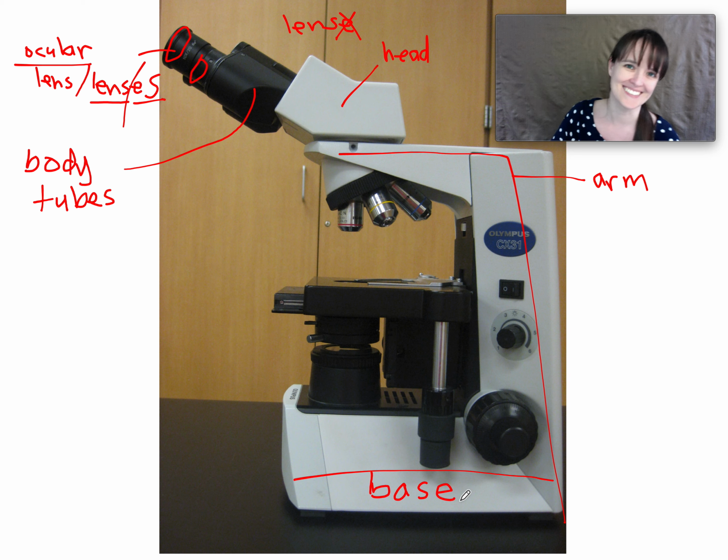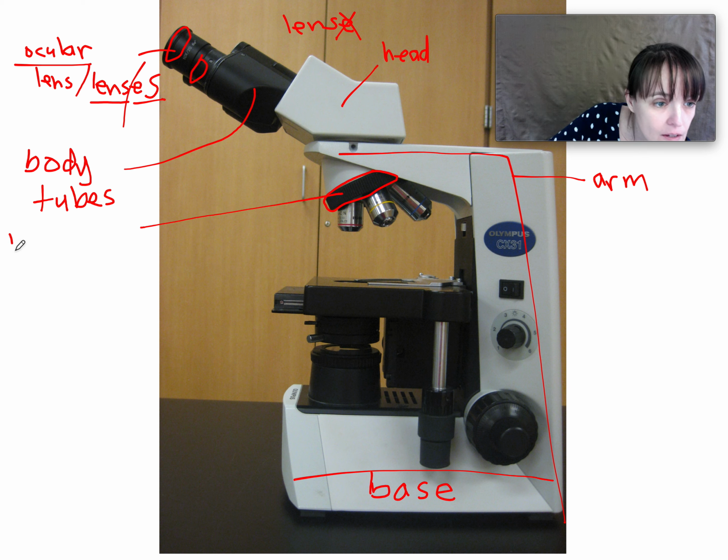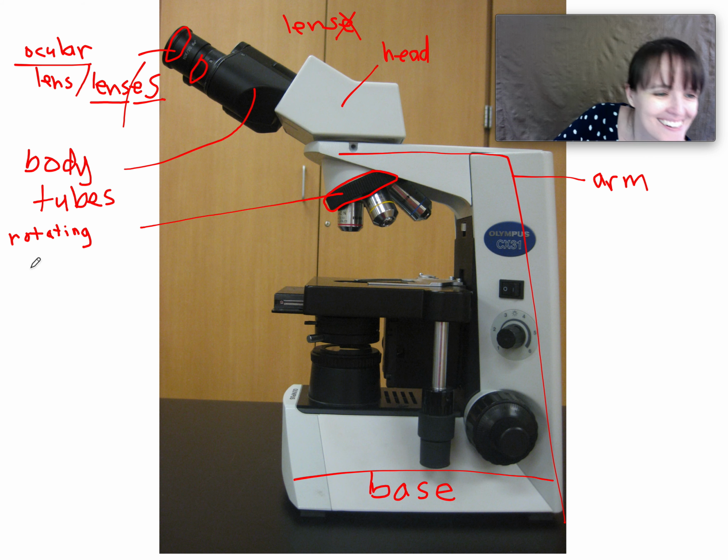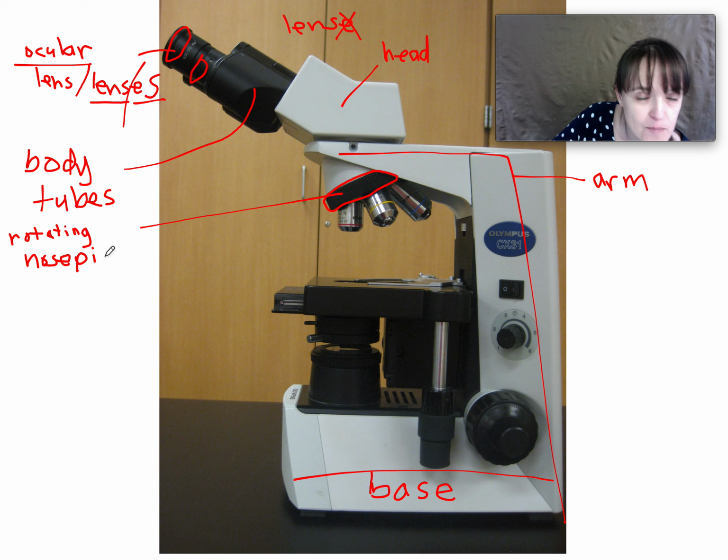So yeah, sorry. Okay. So this piece right here is the rotating nose piece. It rotates. Piece, like a piece of it, not peace on earth.